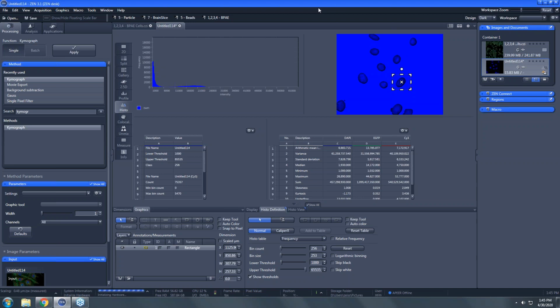So I think we can move on from measurement. What do you think, Nicole? Can we go do some image processing and some 3D rendering and stuff? Yeah, that's pretty exciting. Let's move on to that.